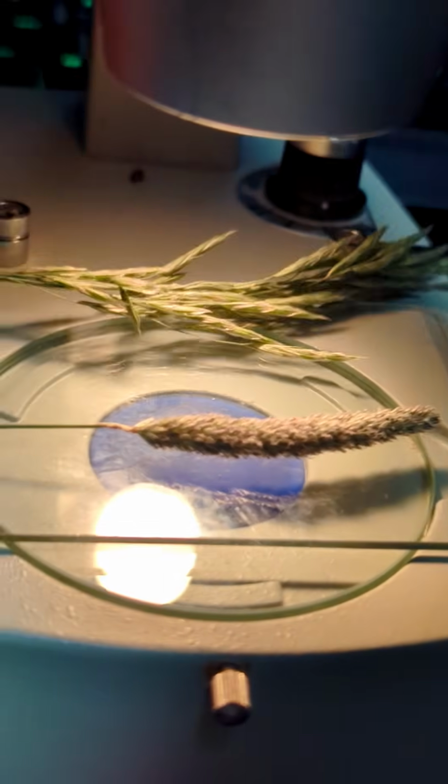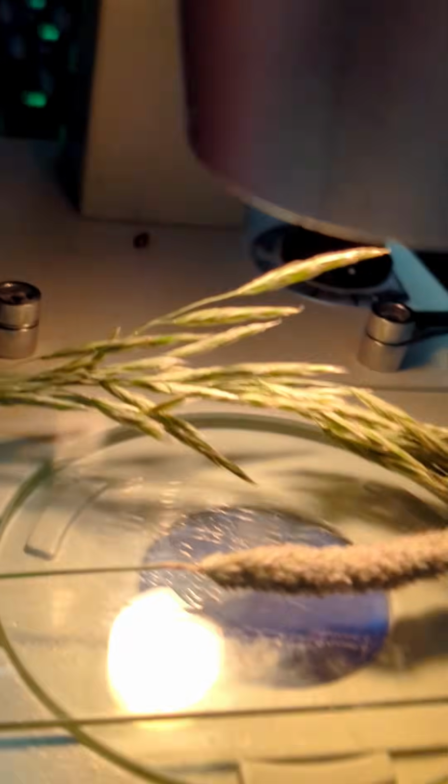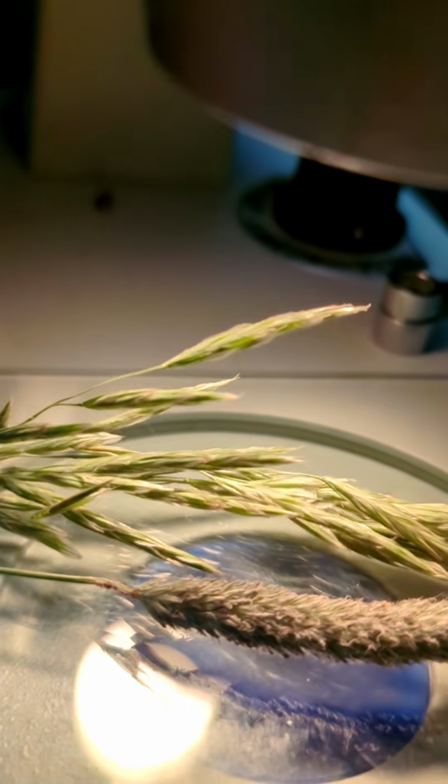Never mind. All grasses are angiosperms and monocots. So angiosperms come in monocot and dicot. That has something to do with the seed when it grows in the beginning. Never mind about that right now. And every single one of these is considered to be a flower.